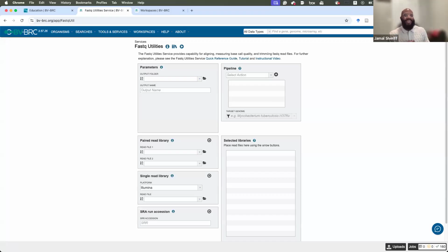The strain was isolated in the spring 2025 semester at UIC's microbiology lab course. Students performed gram staining of their isolate. We know that it's a gram-positive rod-shaped bacterium. Within the handout, our exercise starts on page 4. I include all the results for the biochemical tests. You can look at the results for the Biolog metabolic profiling assay. These colonies were stored in frozen glycerol stocks, and we were able to access those.